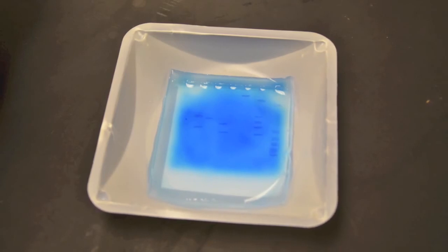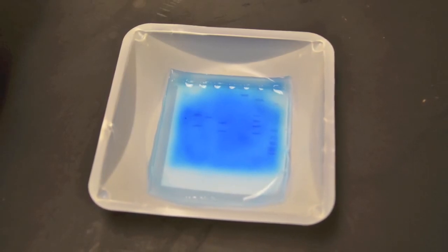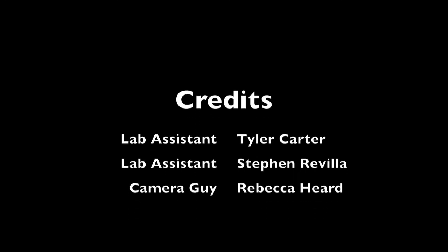Your finished product should have bands similar to those you see here and now we've completed the electrophoresis lab.